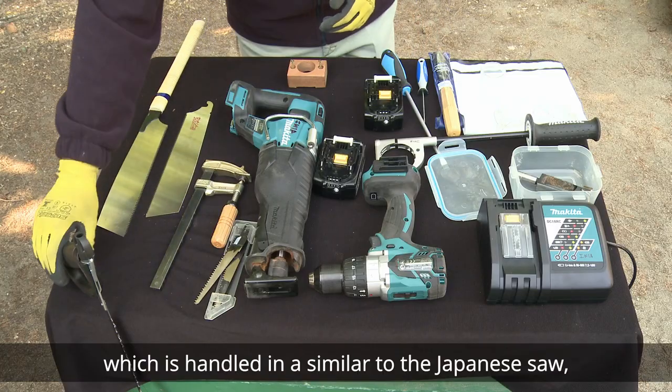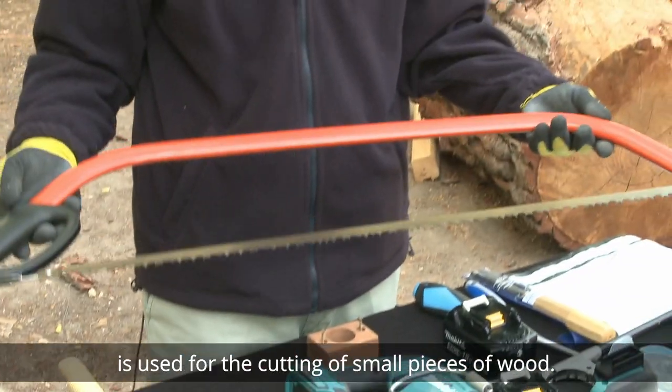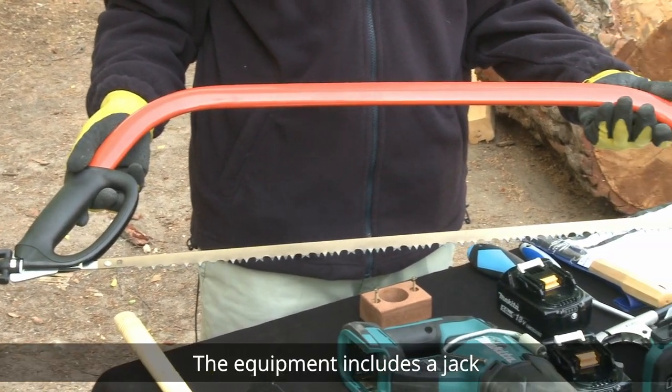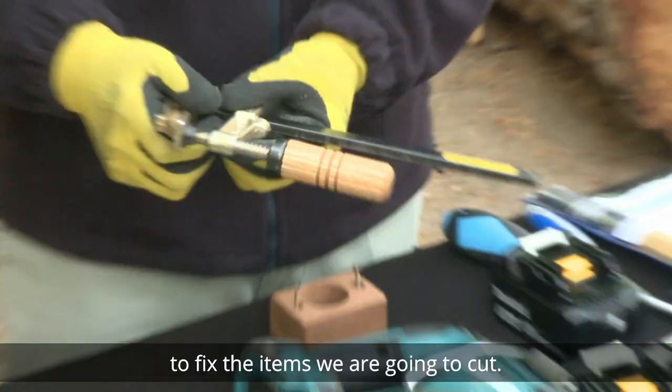The hacksaw, which is handled in a similar way to the Japanese saw, is used for the cutting of small pieces of wood. The equipment also includes a jack to fix the items we are going to cut.